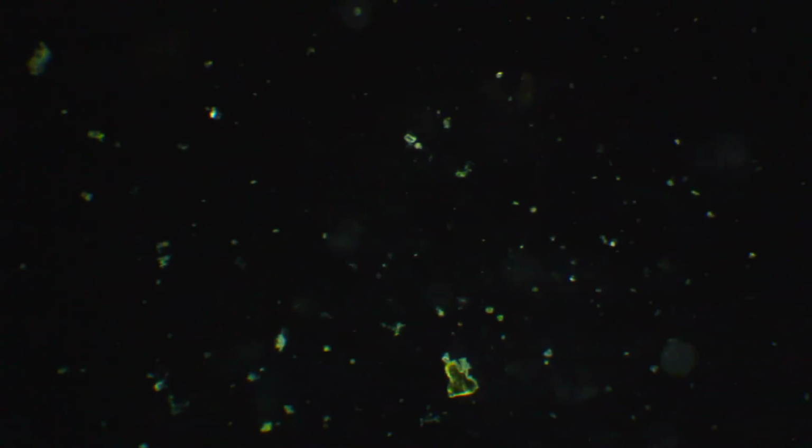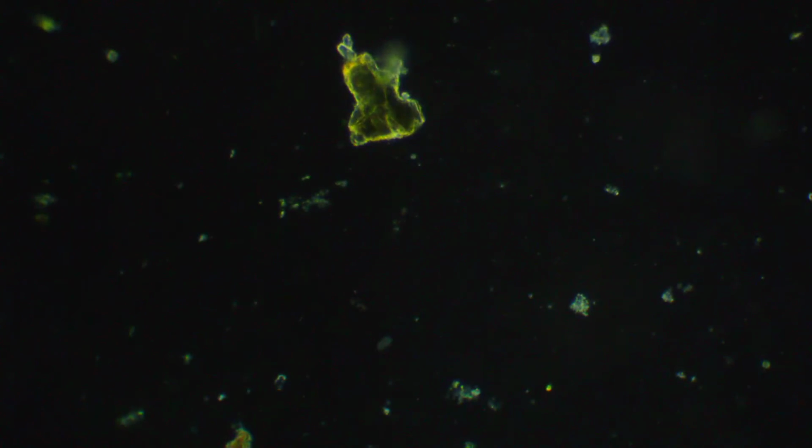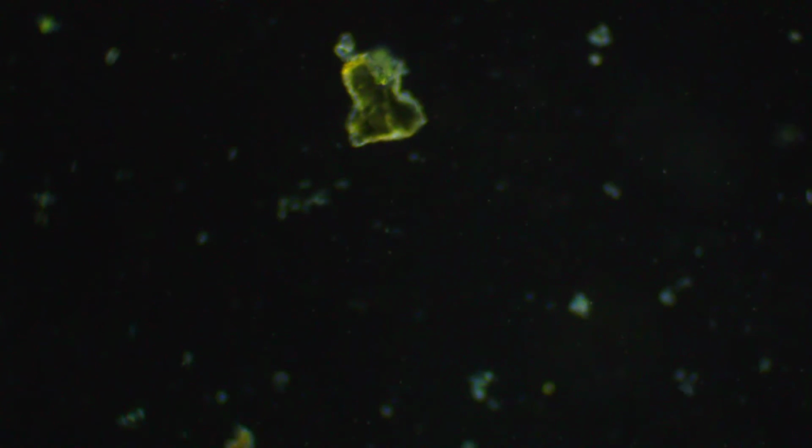Oh look, a rotifer. I'm really good at spotting these little guys, because they look like little flowers sticking out from the moss, you know? Oh, it's not a rotifer. Is it? It really kind of looked like one. No, I don't think it is. Damn, I was totally wrong.